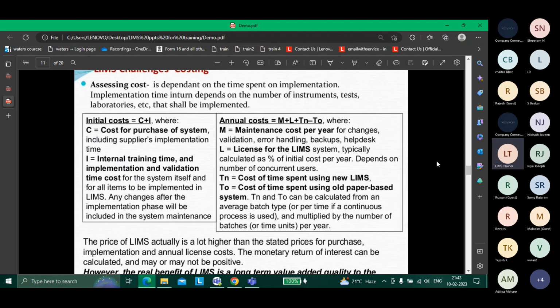Second point, if you are working in a pharma company or if you are part of a university which has taken a Labware license, I don't know if there is any cracked demo version of Labware LIMS. As of now, I was not able to get my hands on those. If I try to buy one version or one license from Labware, they will never give me. First question, they'll ask you, why are you buying? I'm not sure about other LIMS. I am talking about LabLIMS, but this is the truth.